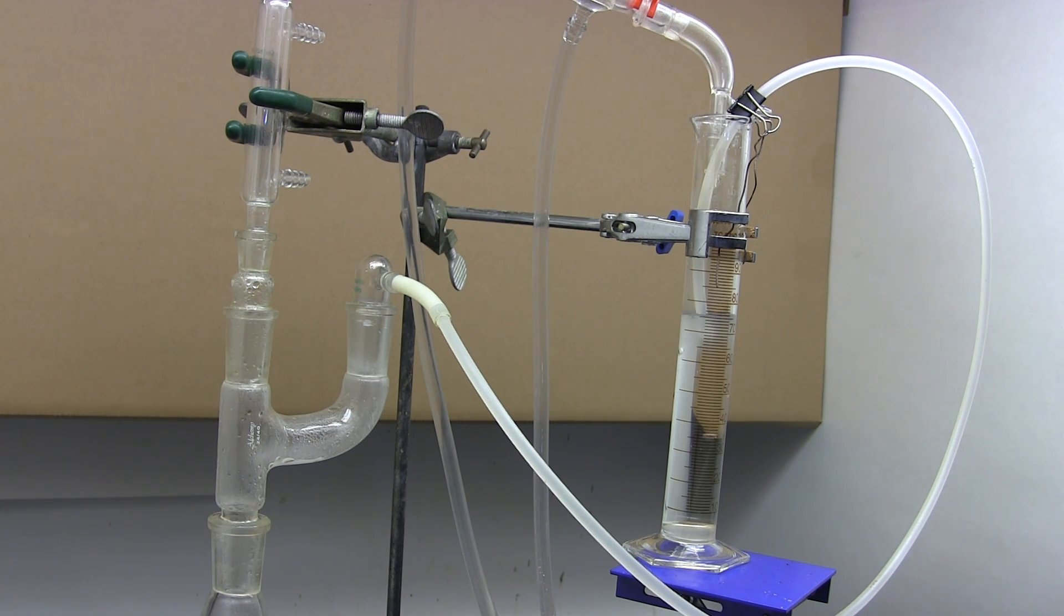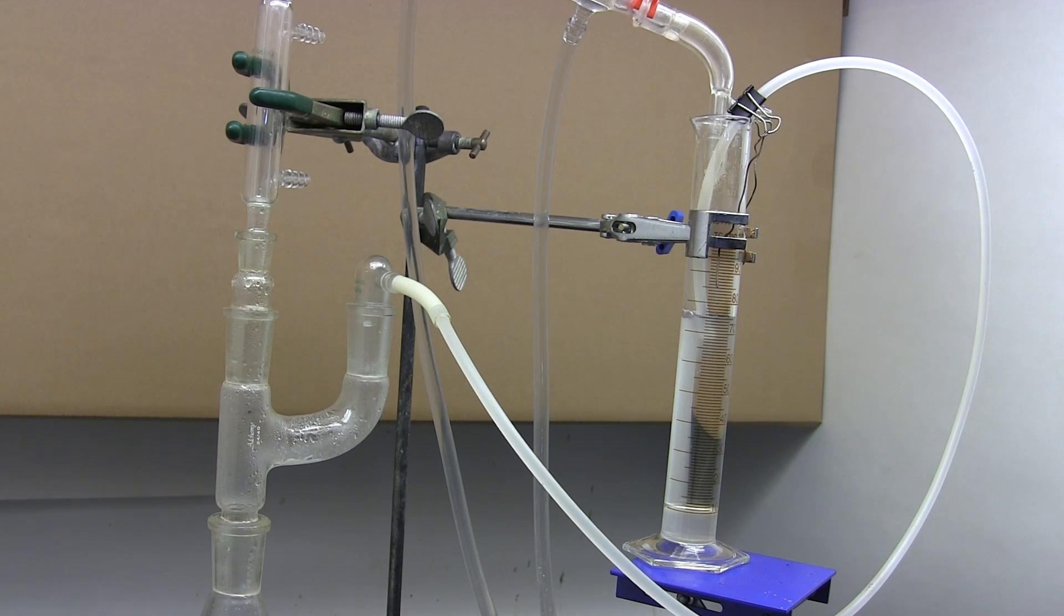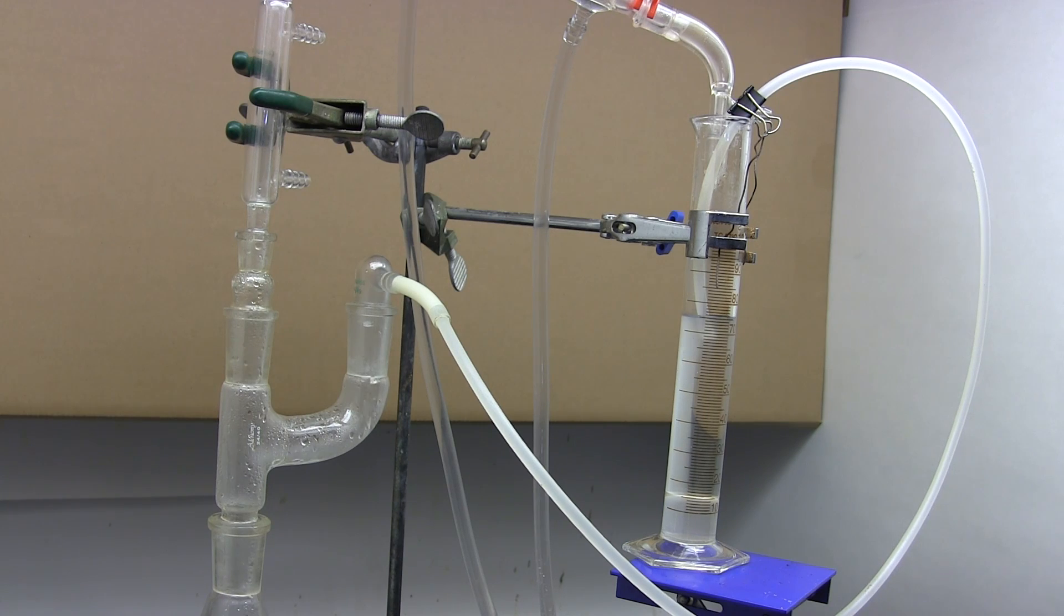Completely self-running and requiring no user intervention, unless it's for emptying the graduated cylinder. Now the whole thing costs about $150 or about the price of a moderately expensive Dean-Stark trap. But since the components are more commonly used for other experiments, chances are a well-stocked laboratory already has most if not all of them. The total effective costs can be considerably reduced.